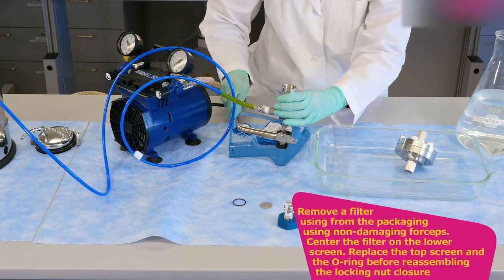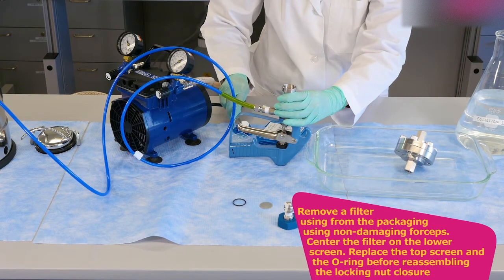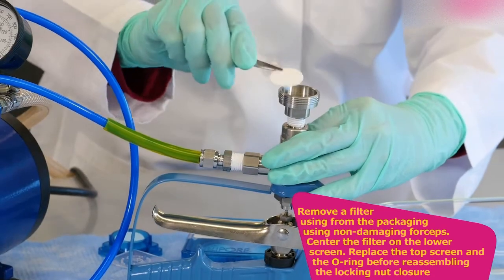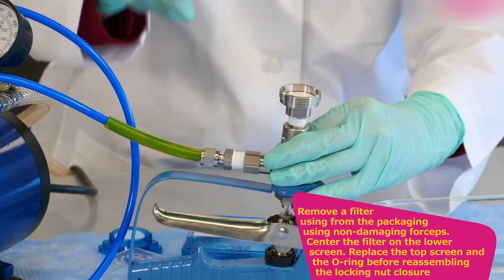Remove a filter from the packaging using non-damaging forceps. Center the filter on the lower screen. Replace the top screen and the O-ring before reassembling the locking nut closure.